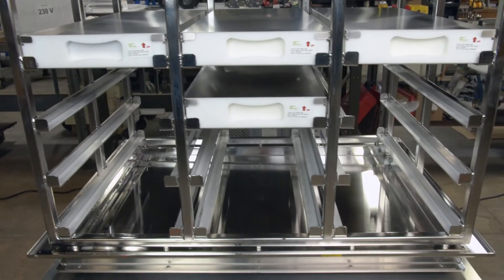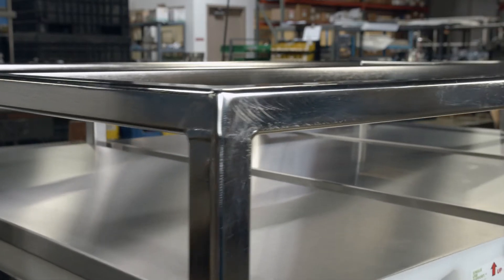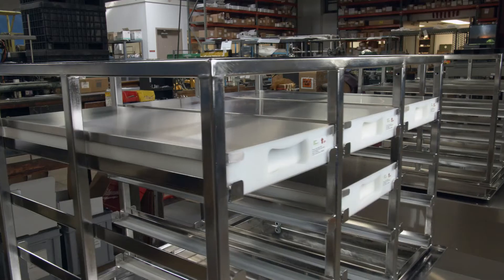Each rack will hold up to 12 containers. This particular unit right here has a custom rack to be able to accommodate single-use bag trays.